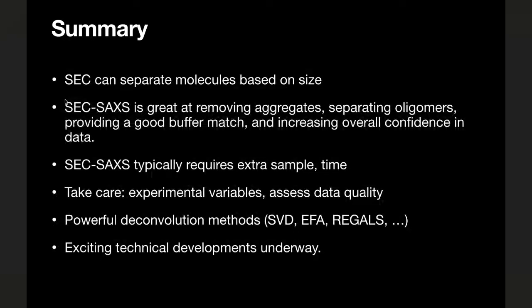And then, one of the advantages is that we have all these powerful deconvolution methods like SVD, EFA, and Regals to get more out of your data than just averaging profiles together. And there are also many exciting technical developments underway. So it's a fun field to keep track of.